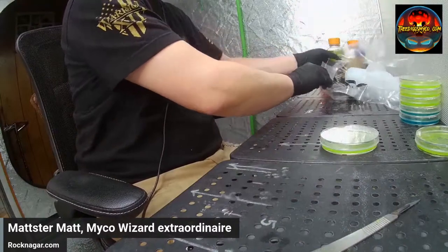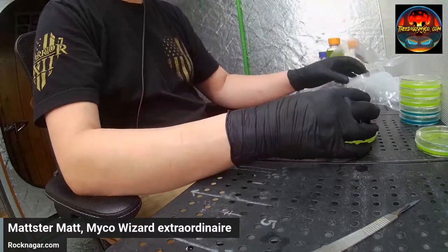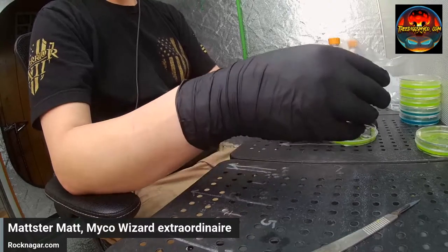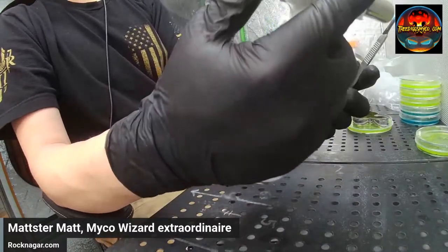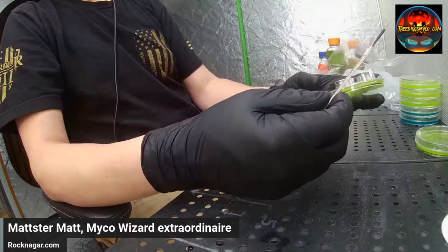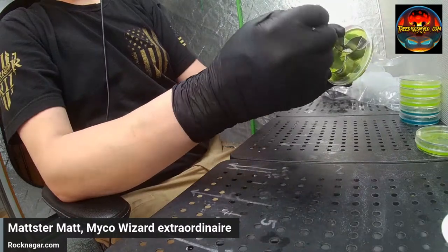All right. Got our good old Playboy bunny. It's always a good place to start. Now this was sterilized in the pressure canner there. I should have sterilized my scalpel before getting in here, but we'll nuke it now with the dab torch here. I've found that it's kind of difficult to get these little deals out of here, so it helps if, when you got the deal in there, you can kind of pry it free like that.